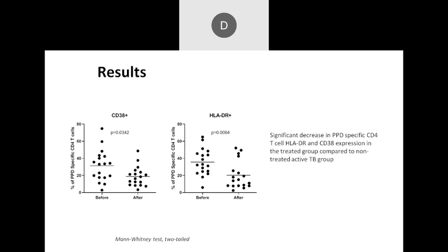Yeah. So, it would have been nice to see if they all went down, but no, it's just cross-sectional. And it was 8 weeks after treatment. So we don't have the data for the patient after treatment that they have before treatment. No. So yeah, different patient. We only had a 2-week window to collect the patient. So it wasn't ideal, but we were able to get some information.